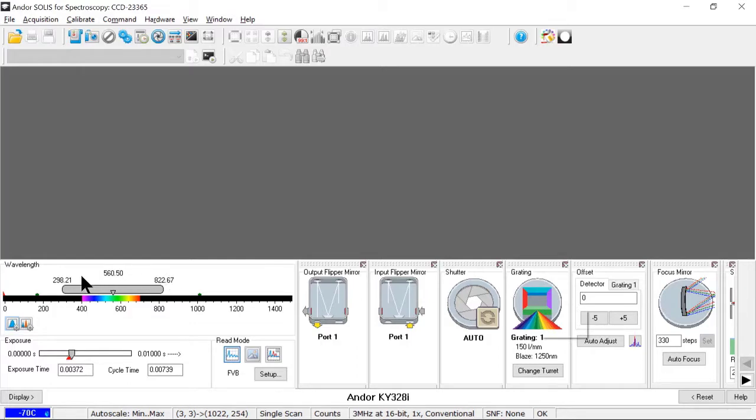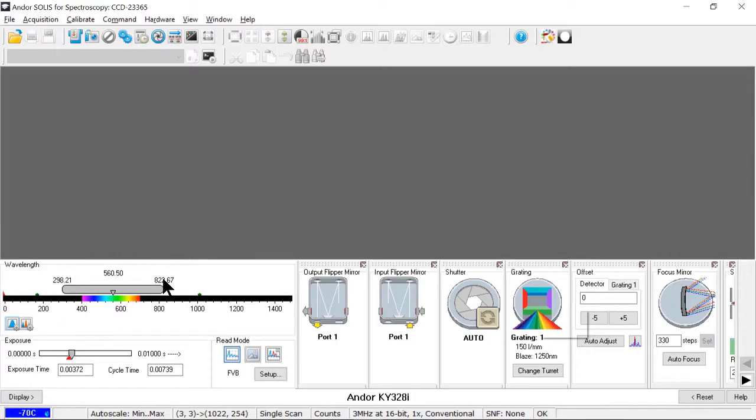And here you can see the wavelength bar has been updated with a very wide bandpass of the low resolution grating. Here, instead of just covering a few nanometers, I'm covering all the way from the ultraviolet to the near-infrared in one shot. And here is the simplified camera setup.